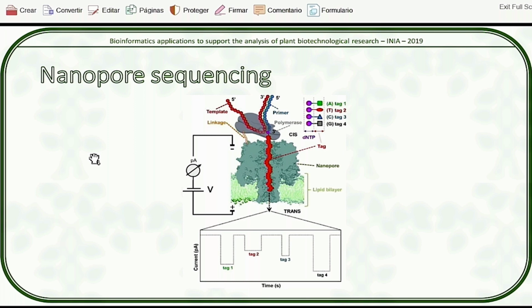The director of the company, Nanopore, said that they have at least 15 or 20 different enzymes or different pores that they test all the time, and they keep creating new ones. The most important part is of course the part that interacts directly with the DNA. So what they try to do is make it as short as possible. Why? Because the longer it is, the more nucleotides are going to be inside of the pore.